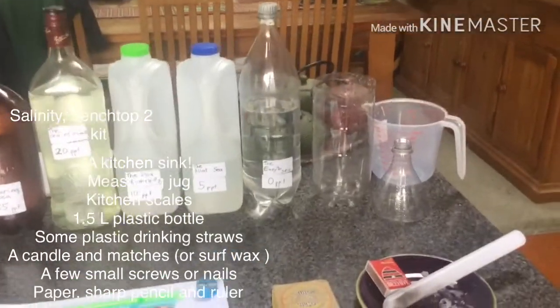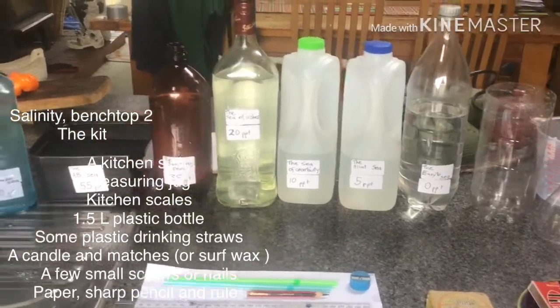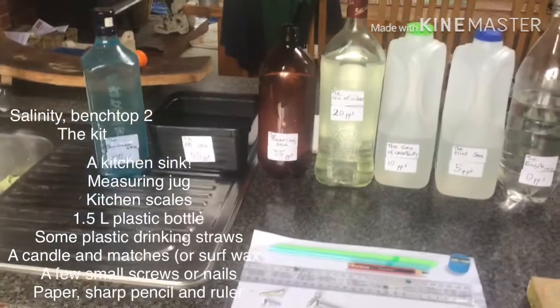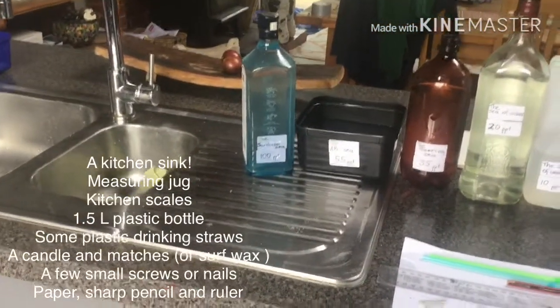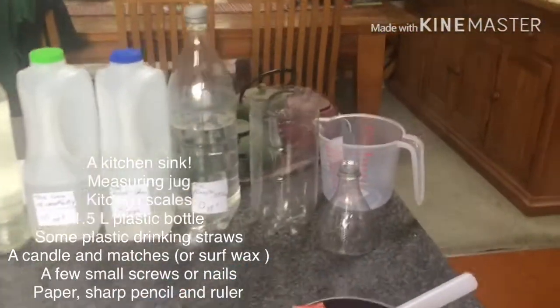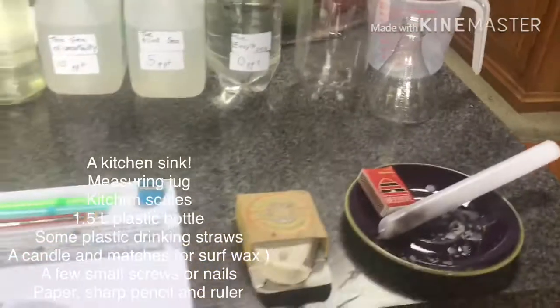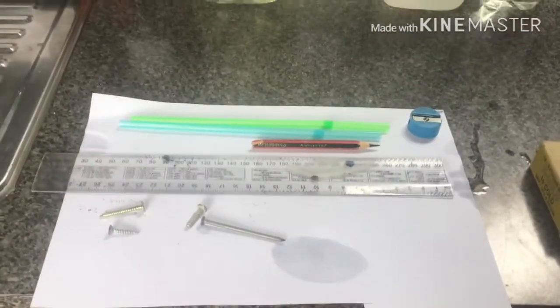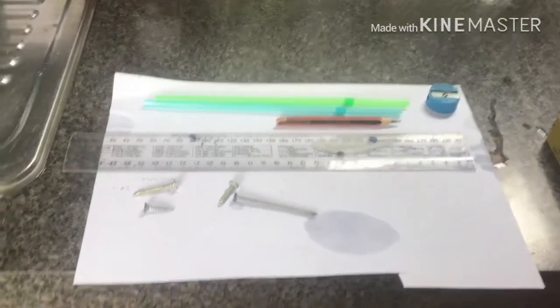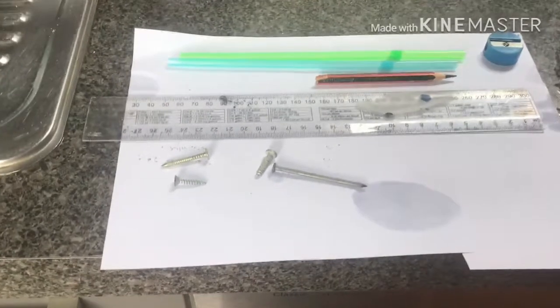We've made up our solutions. We've got our 0 parts per thousand, 5 parts per thousand, 10, 20, 35, 55 and 100. We've also got our measuring cylinder, jug and our funnel. The other things we'll need for the next activity are some paper, ruler, sharp pencil, pencil sharpener useful, a couple of straws and an assortment of nails and screws, nothing too big.